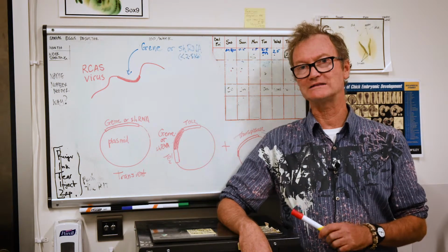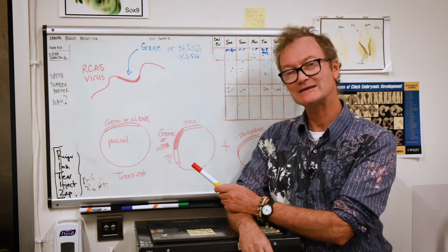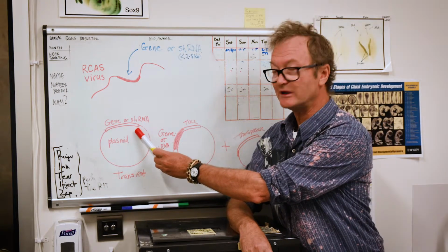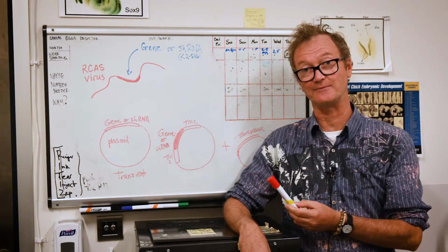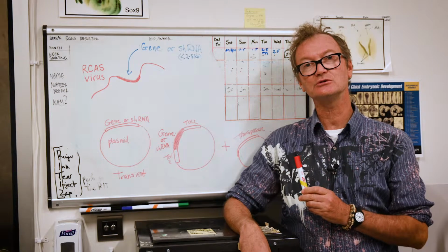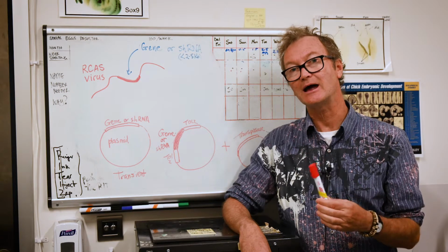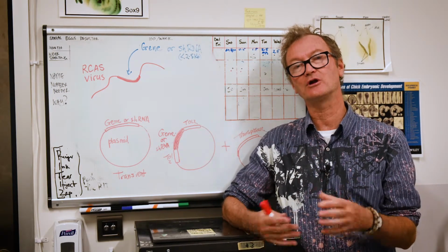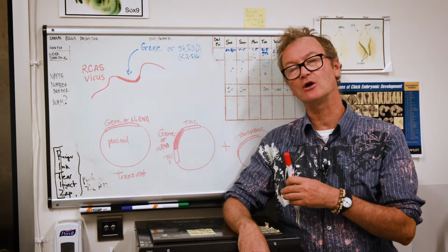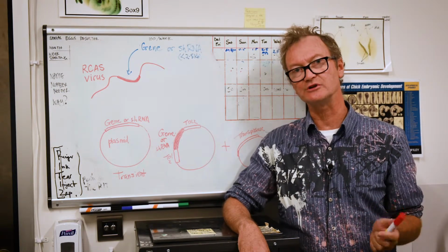One of the typical ways of delivering DNA is through a plasmid vector. So that's shown here. A plasmid is a small circular piece of DNA that can be propagated, and your gene of interest can be cloned into that plasmid vector, or a short hairpin RNA. This can be injected into the region of the embryo of interest, and then the electric current applied, and the DNA is taken up by the cells because the electric current loosens the pores of the cells. This tends to be transient, and so you can target a small number of cells and then the plasmid is eventually lost over cell division.